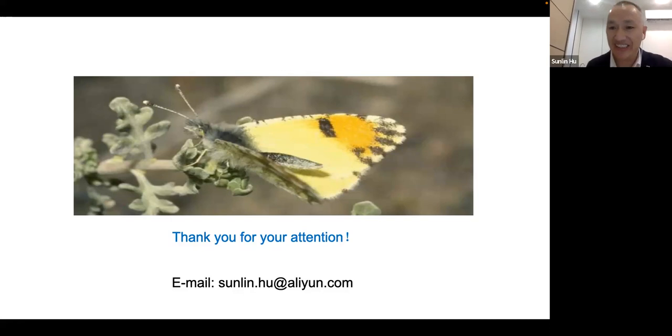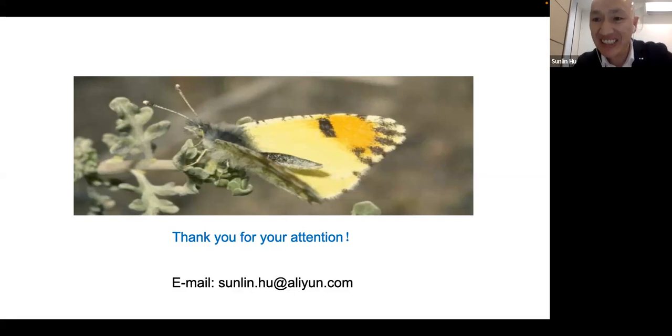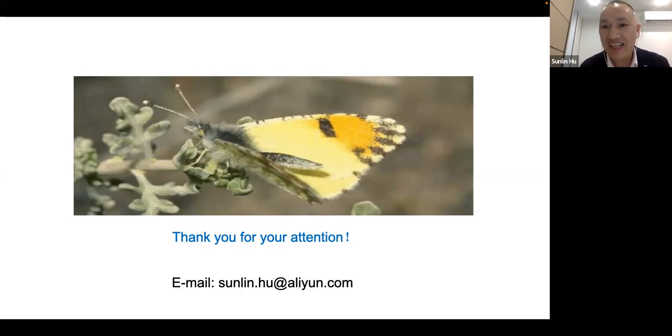I just mentioned this test has not been adopted as a routine test in the United States, but in China or other countries in Asia, it is widely used. Most forensic doctors will send samples to a diatom lab for analysis.